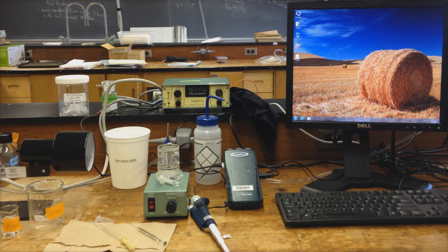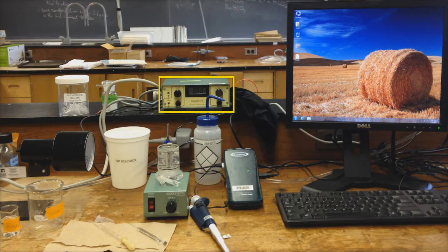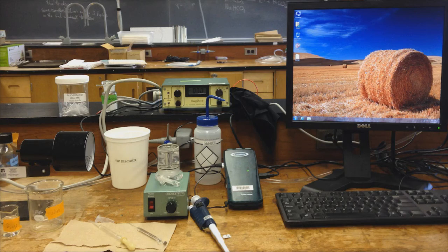The O2 electrode apparatus sits firmly on top of the stirrer. Samples must be vigorously stirred throughout the experiment. The O2 electrode is attached to the Hansitech control box. The display on the control box shows the voltage output of the electrode in millivolts. I will explain how to use the various controls in the video.